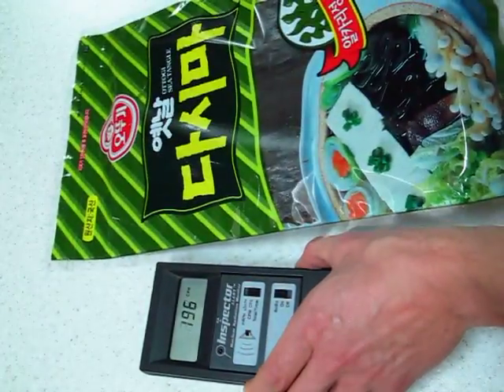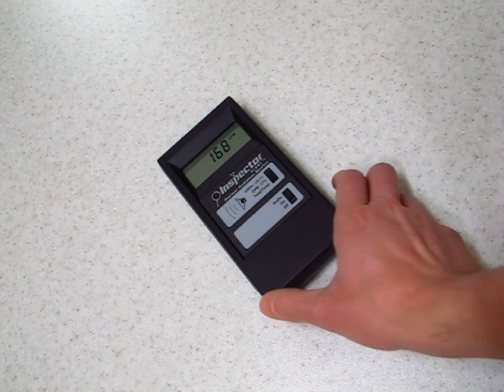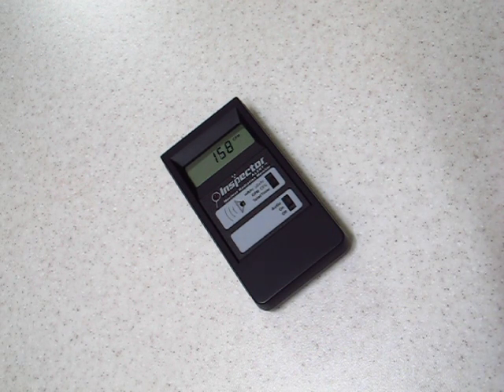So, the seaweed has been unopened. I'll do a test on the seaweed itself a little later on. Let's use the seaweed.